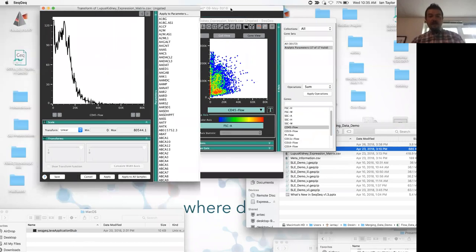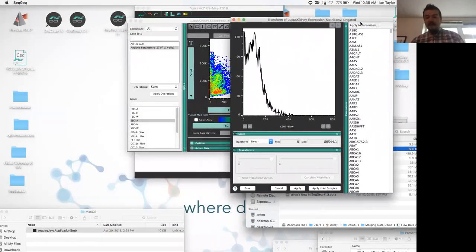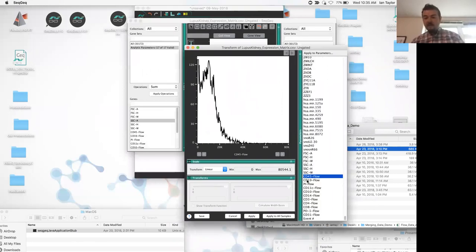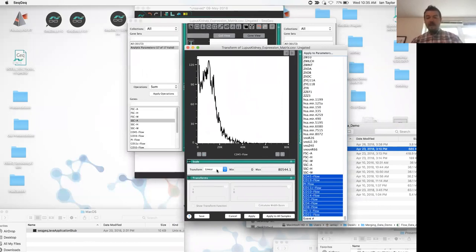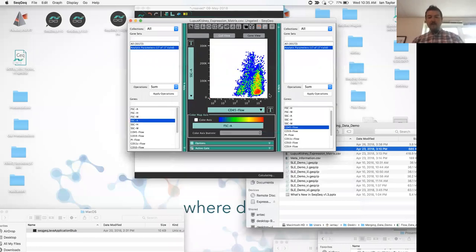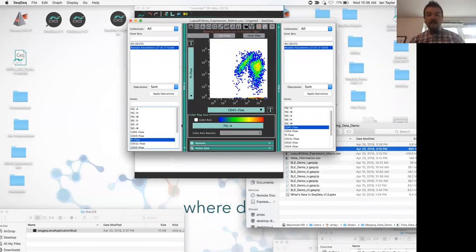Going to customize axes — just like in Flojo — I get a list of all parameters. I want to find all those newly merged parameters at the end of the matrix, select all the FL fluorescent parameters, and switch to a log scale, then click apply. Now we could do panleukocyte versus PI and start to pull out populations just like you would within flow, drawing normal flow gates to get our canonical populations.